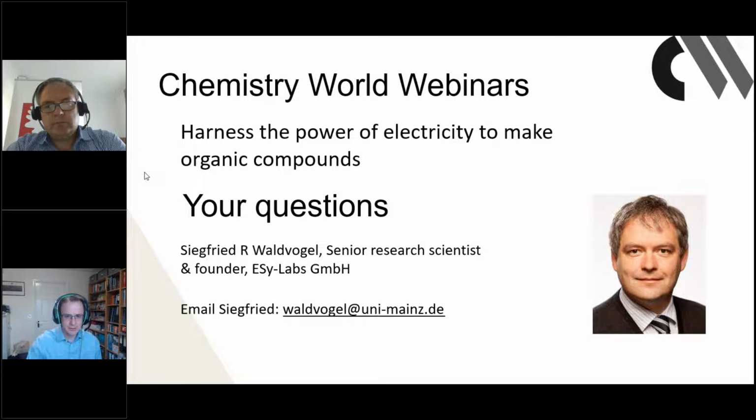Great. Yeah, I guess there's quite a few different parameters to take into account in that decision, but yeah, fantastic. Okay, so next question is from Yilin. She says that looking at a lot of your reactions that you've put up on the slides are run at 50 degrees C. How does the temperature as a parameter change? How do you arrive at what kind of temperature to use, and how does that affect the reactions?